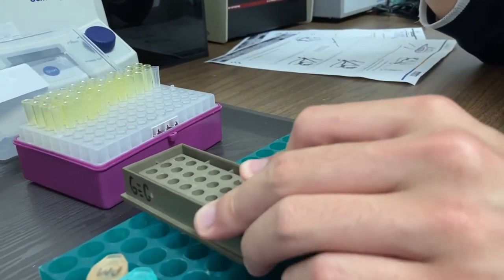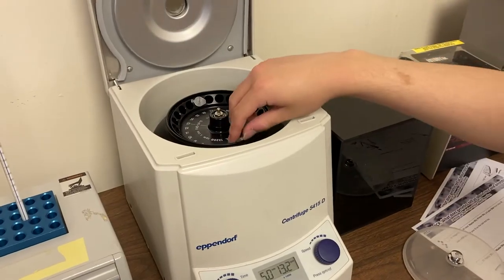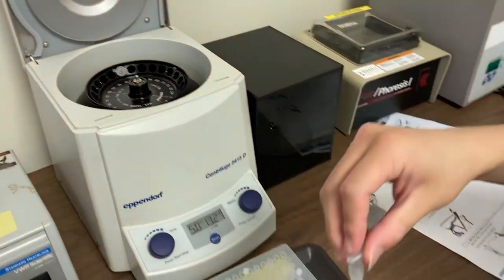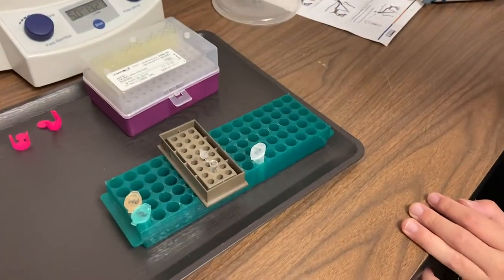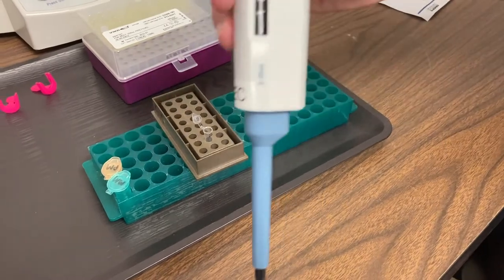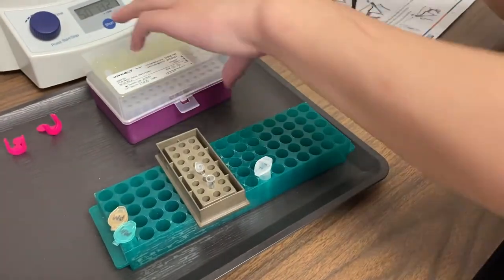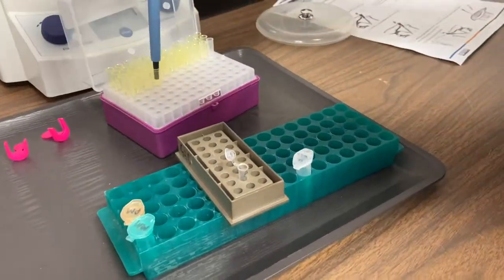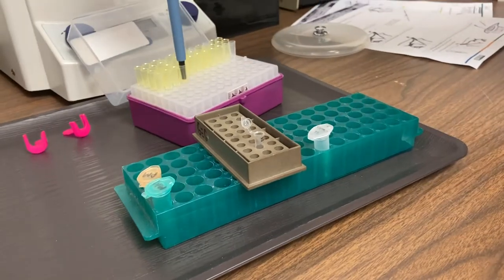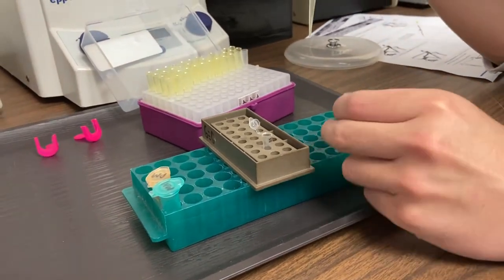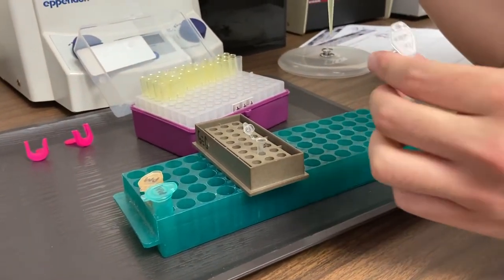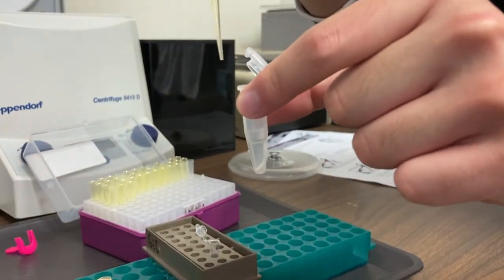So, we've added our primer mix and our master mix to our tube. Now we have to retrieve our DNA from the centrifuge. You're going to set your micropipet to 10 microliters and get a fresh tip.